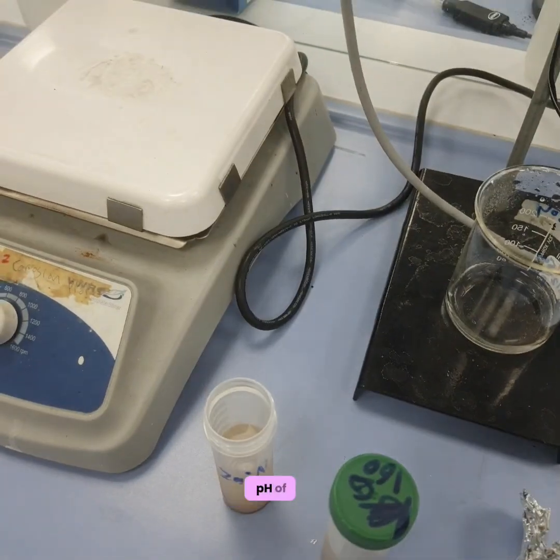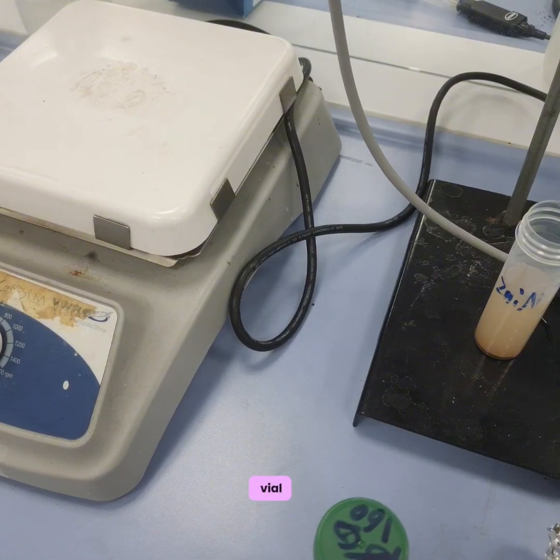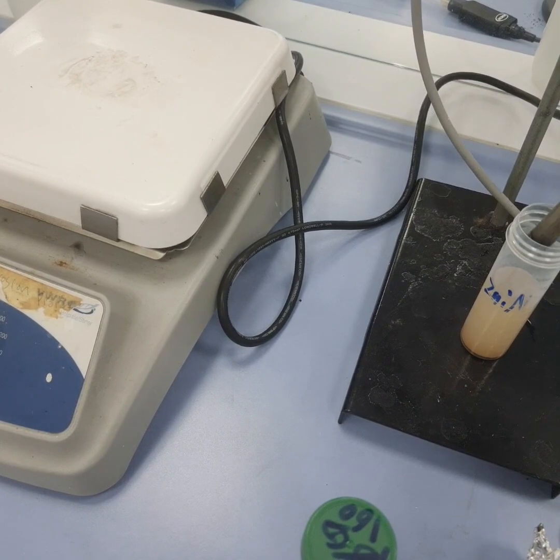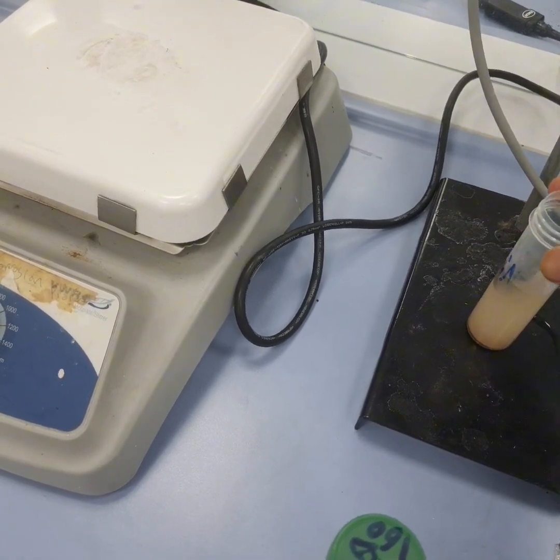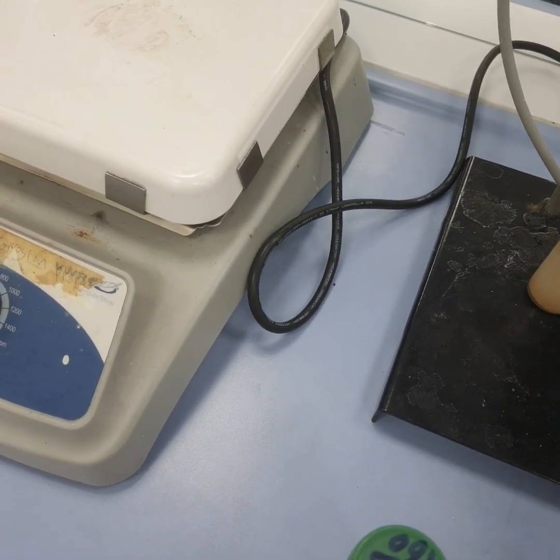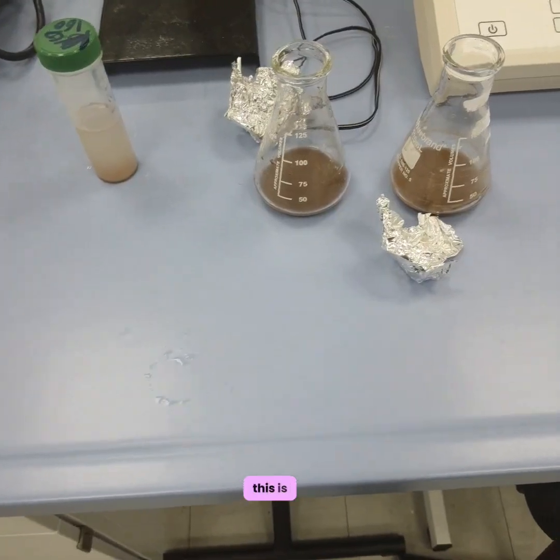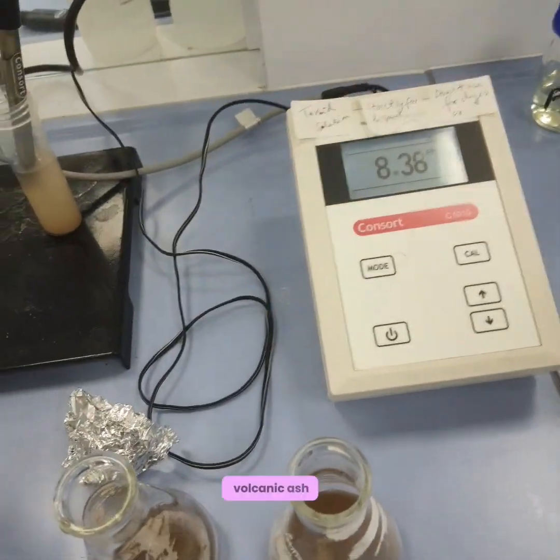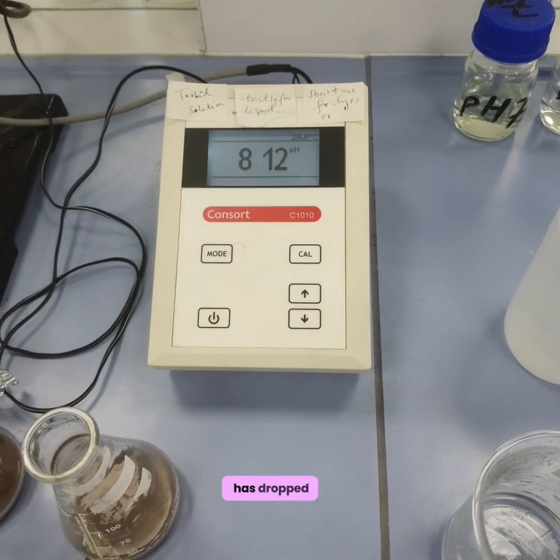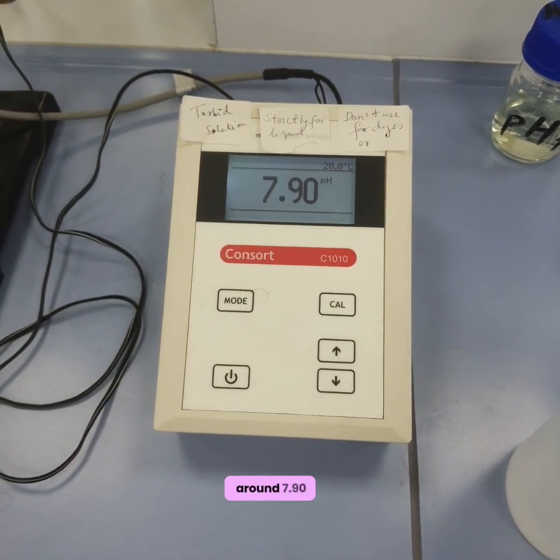Now we will measure the pH of these one by one. The ideal way is to remove the top layer from the vial. What I am doing is just dipping it on the top. This is the pH of the volcanic ash. Let's wait till it is stabilized. So this has stopped at 8.12. And the pH of the base modified volcanic ash is around 7.90.